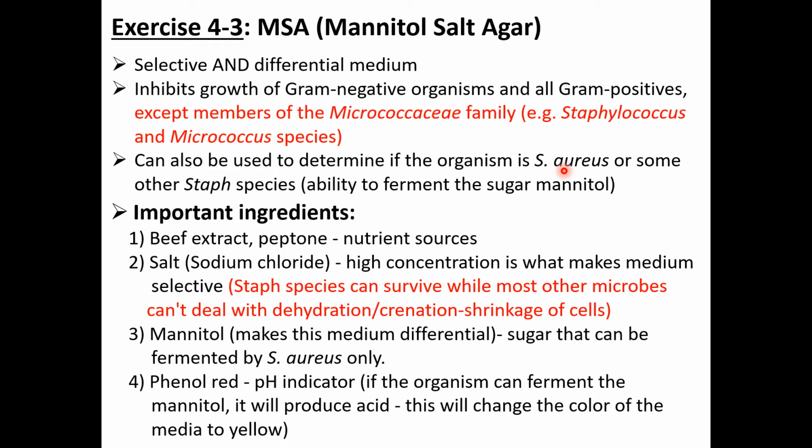Okay, so we can see if there's fermentation or not, because the way we used to grow the bacteria, the media that we had was just a regular medium. So if there was any fermentation going on, we couldn't tell. We just knew that certain species can ferment, but with the regular medium that we use, either on a slant or on a plate, there's no way you could tell that the bacteria is actually fermenting.